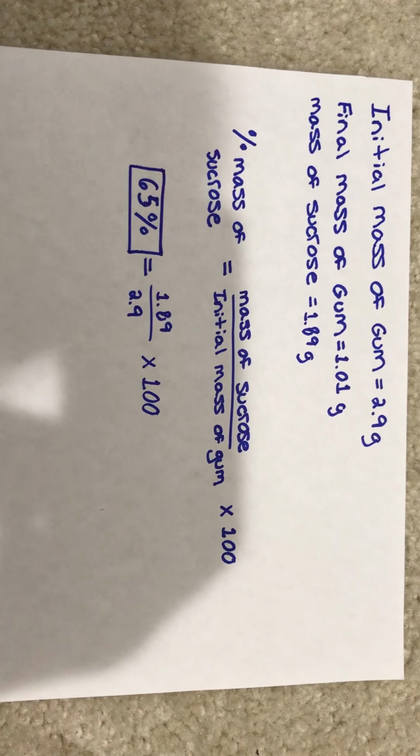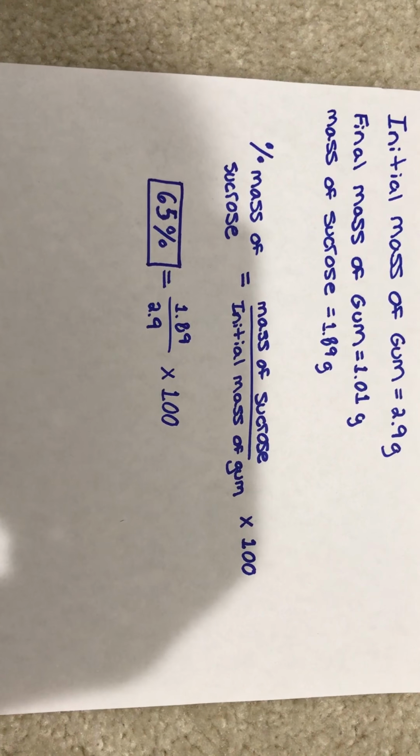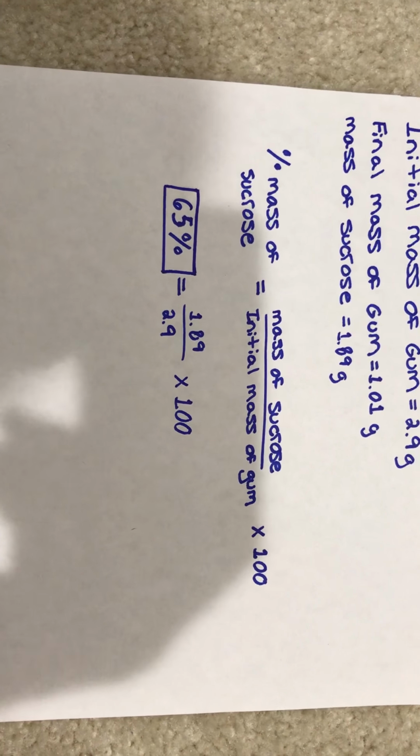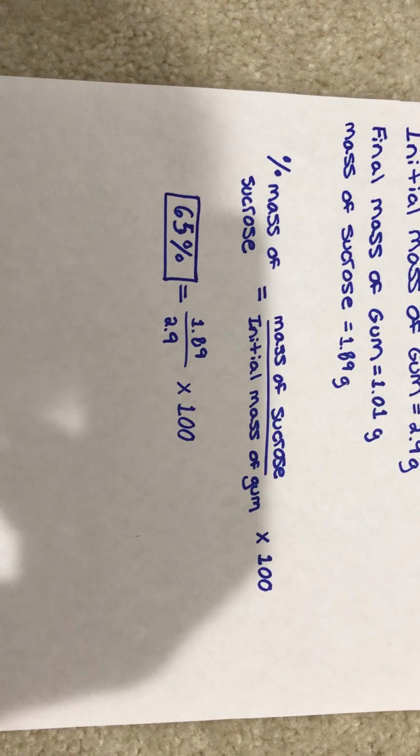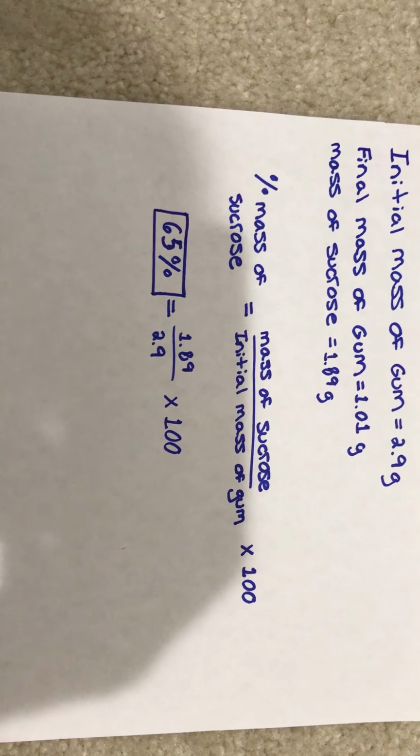Alrighty, so this is the bubblegum lab, and for this lab we were basically just finding the percent mass sugar, or the percent mass sucrose, in a piece of gum.